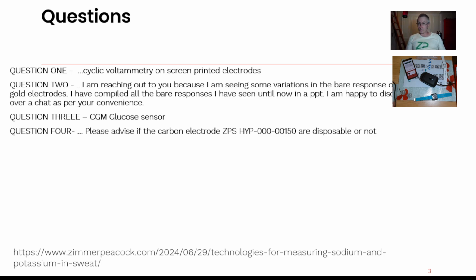And that is a common thing. This is the world of electrochemistry and chemistry and biology. So whether something is reusable really depends on what the person is putting onto those screen printed electrodes. Strong acids, strong bases, strong organic solvents, then yeah, that's going to be a problem.